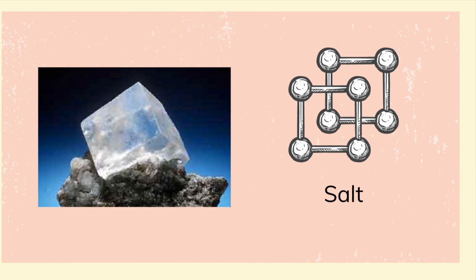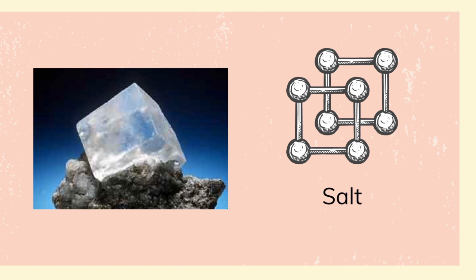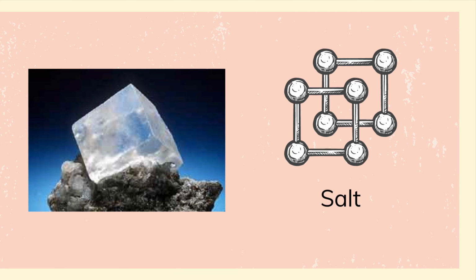Salt is also known as sodium chloride. Its crystals are clear and cubic in shape. And remember, science is everywhere, even in unexpected places.